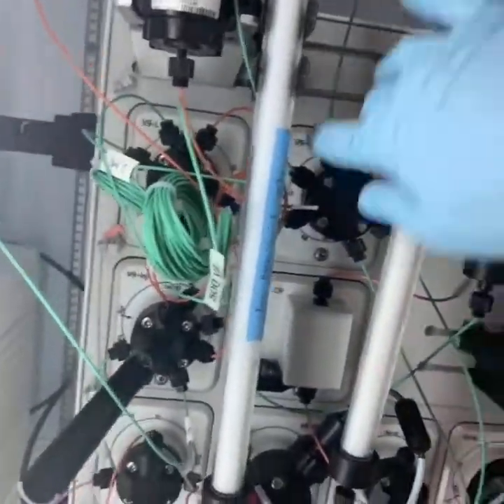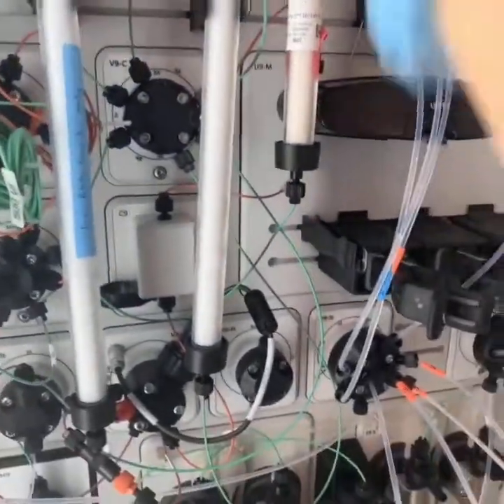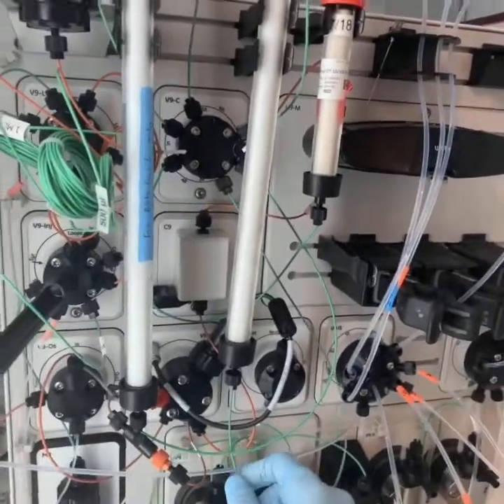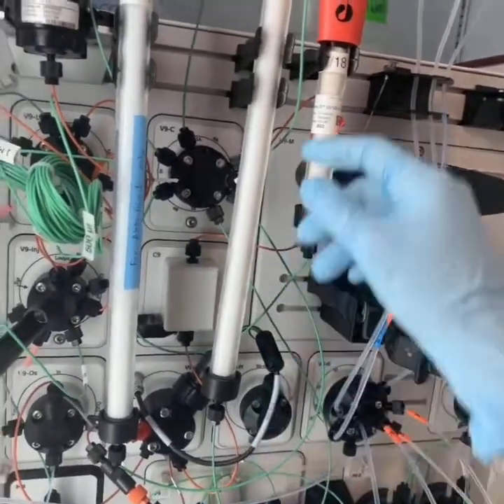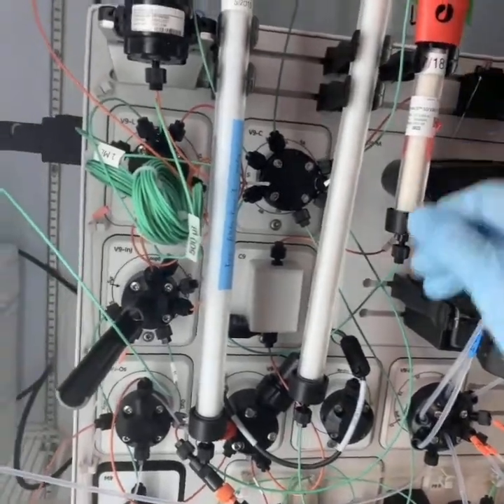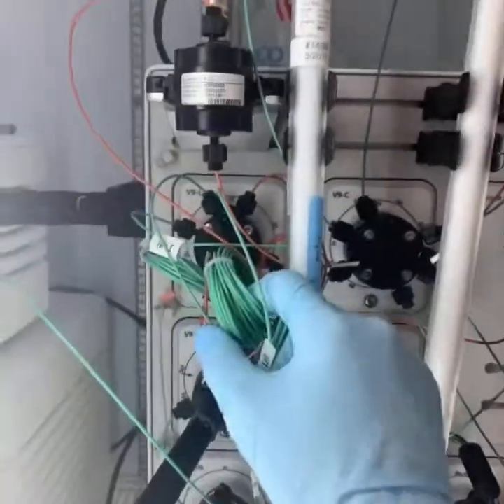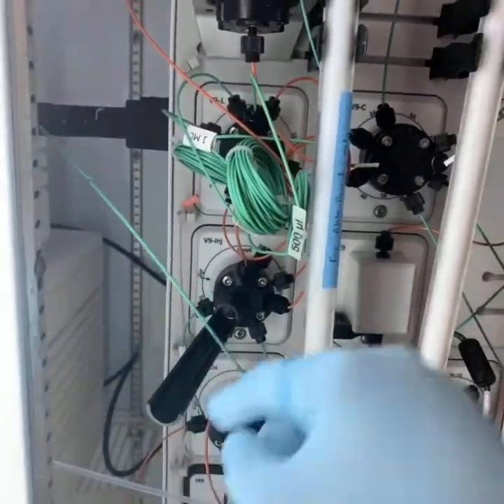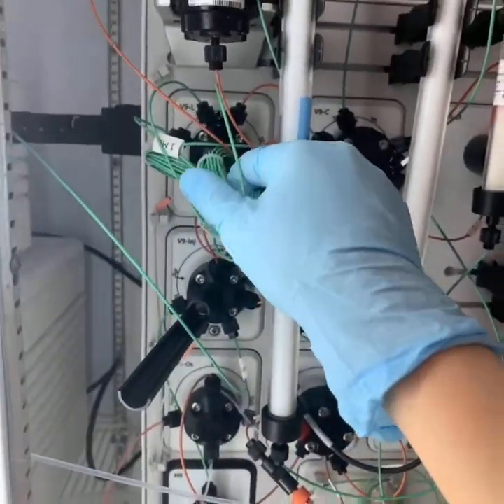Then once you go through the column, you can see these tubing lines going into the column and out of the column. And so these tubings are really thin, so you want to make sure that your protein is filtered before you try putting it through this stuff. These are the sample loops. So this is where you can hold your protein. So you can inject it into here and hold it in here until you're ready for it to come out.